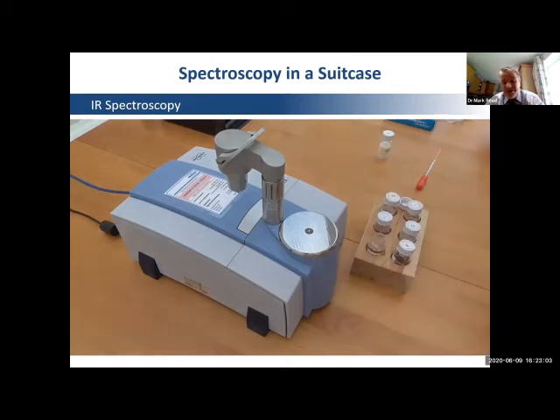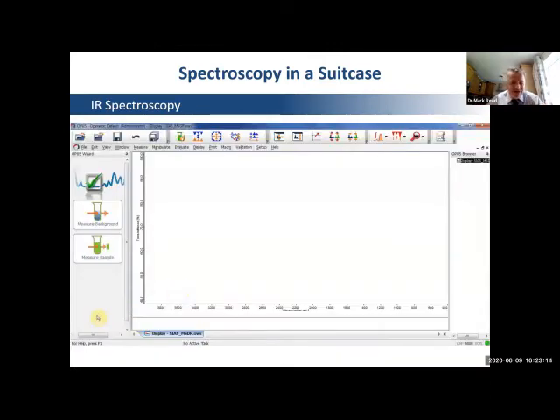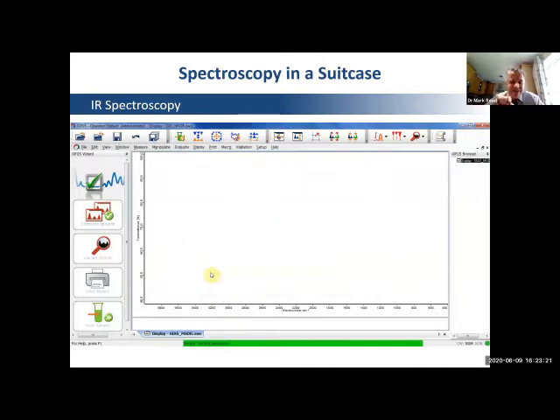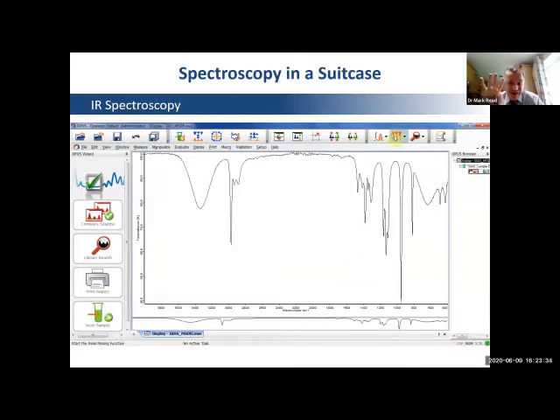So once our sample is on that instrument, we go back to the laptop that controls it, and we now run our sample. So I'm going to go from the instrument back to our control, run our sample, and you'll see how quick. This is real time. I'm labeling the sample, sample B. I'm now going to start my sample measurement. Down here, you'll see it's doing the 8 scans. And after the 8th scan, it will average that data to remove any noise. It will take away our background. And then, just as I've been talking about, that is the spectrum.